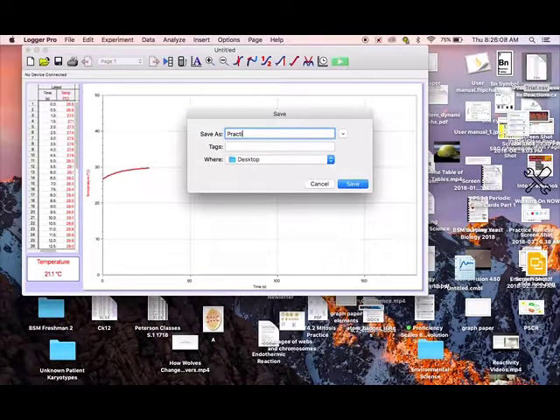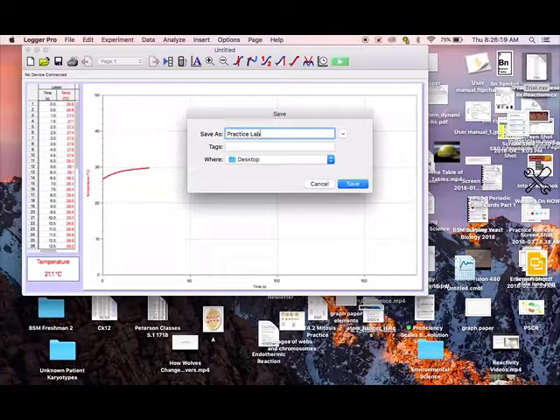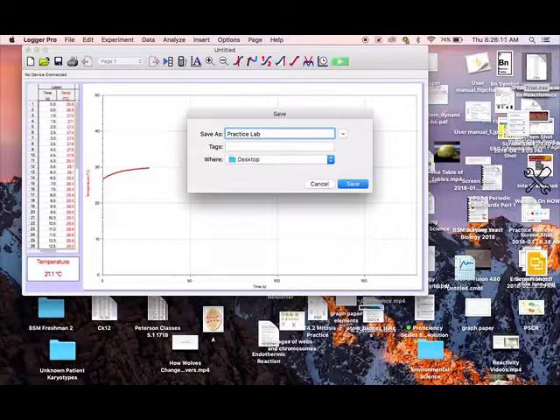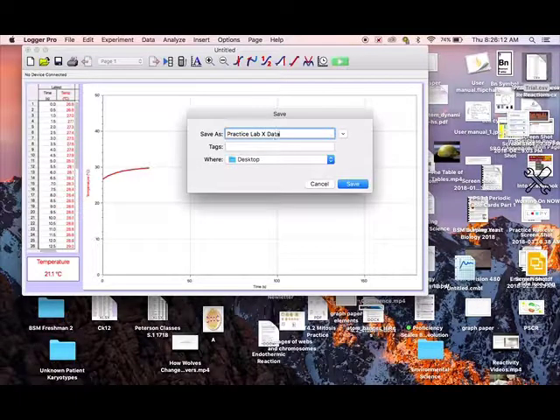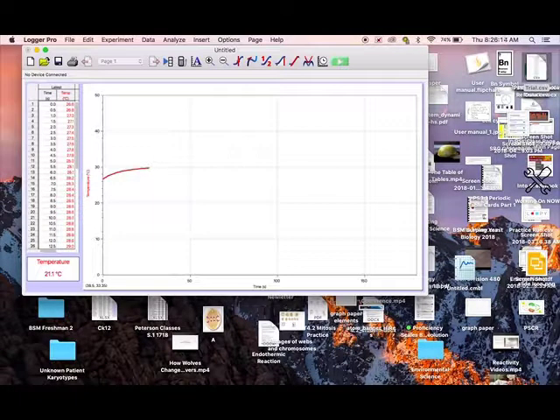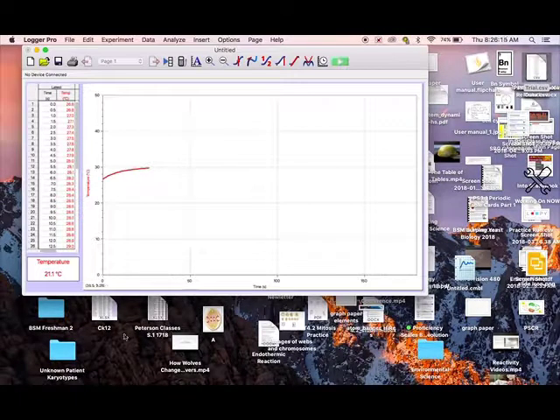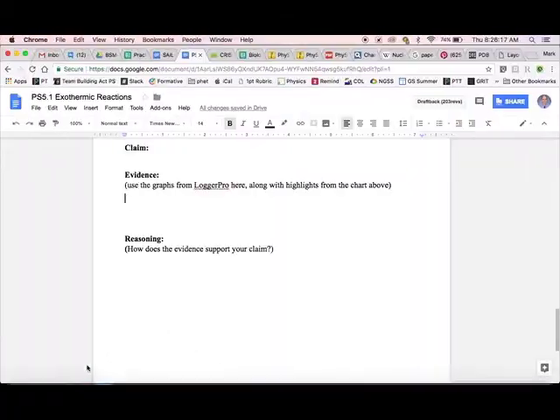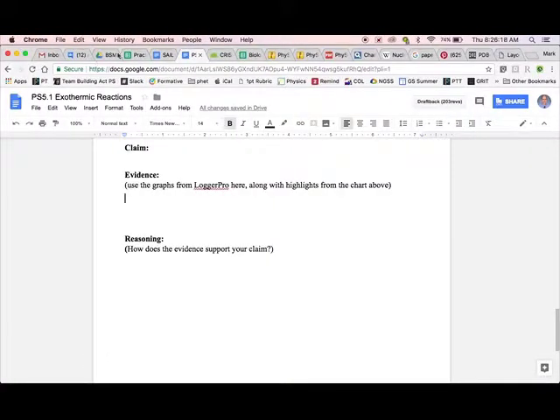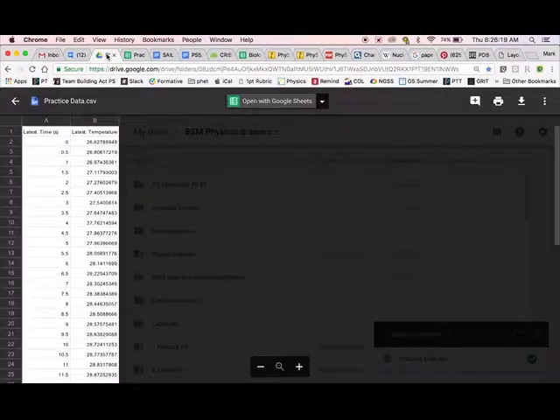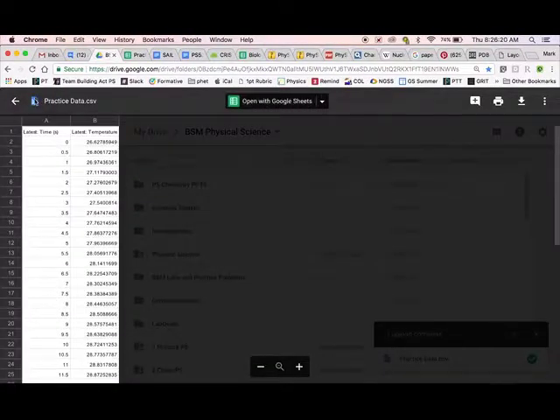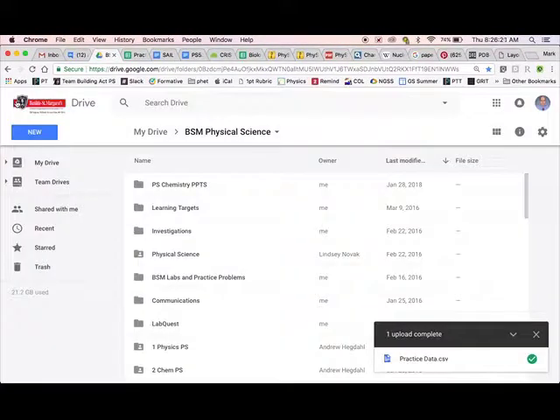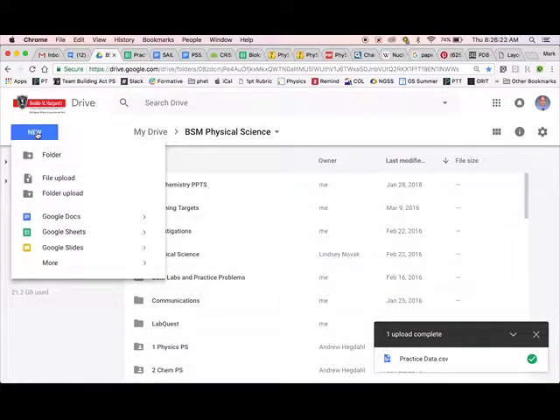Make sure you label it something. So practice lab, whatever, X data. I'm putting that somewhere that I can find it. Now I'm going to head to Google, my Google Drive. That's where I'm going to put it, right in that claim, evidence, and reasoning folder.